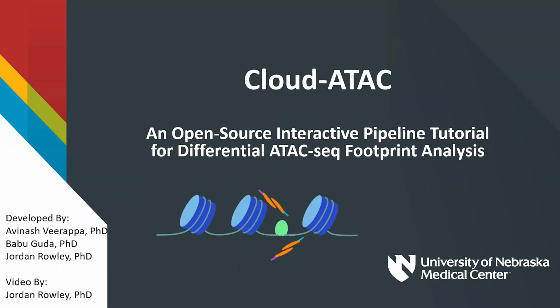Welcome to Cloud-ATAC, an open-source, cloud-based, interactive pipeline tutorial for differential ATAC-Seq footprint analysis. This module will demonstrate an example analysis pipeline for bulk and single-cell ATAC-Seq data implemented in Jupyter Notebooks on the cloud. The purpose of these tutorials is to help users familiarize themselves with the analysis steps involved in processing ATAC-Seq data, including special considerations for single-end versus paired-end sequencing, as well as for single-cell sequencing.